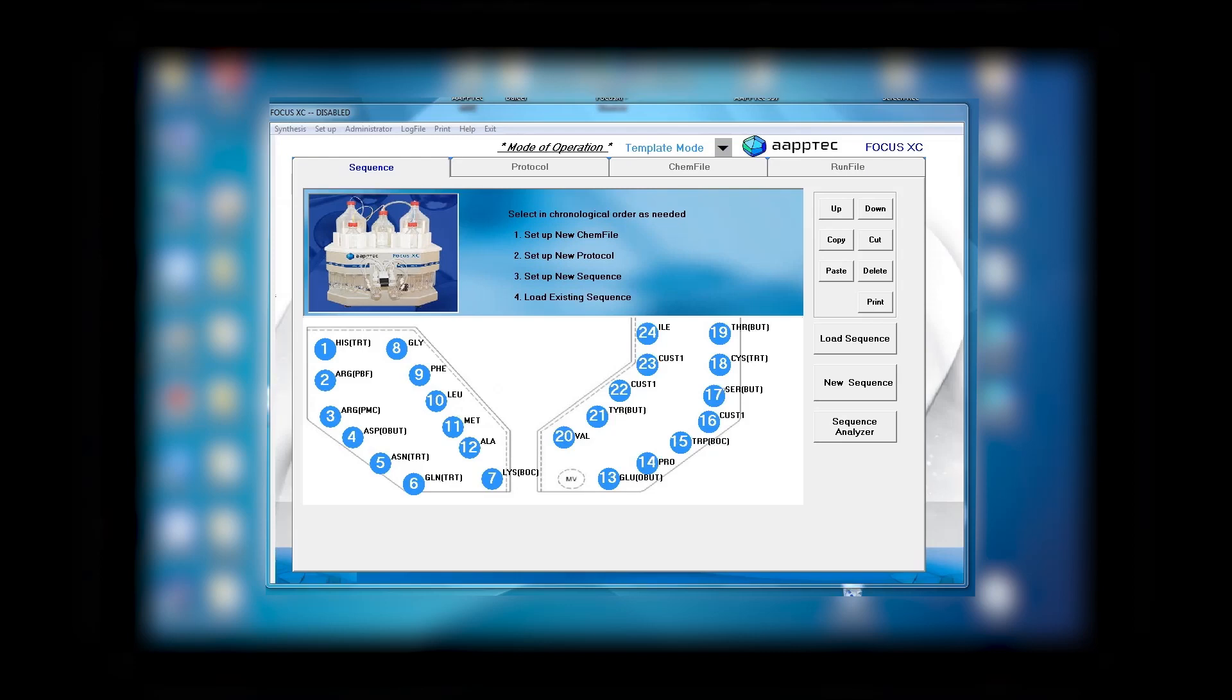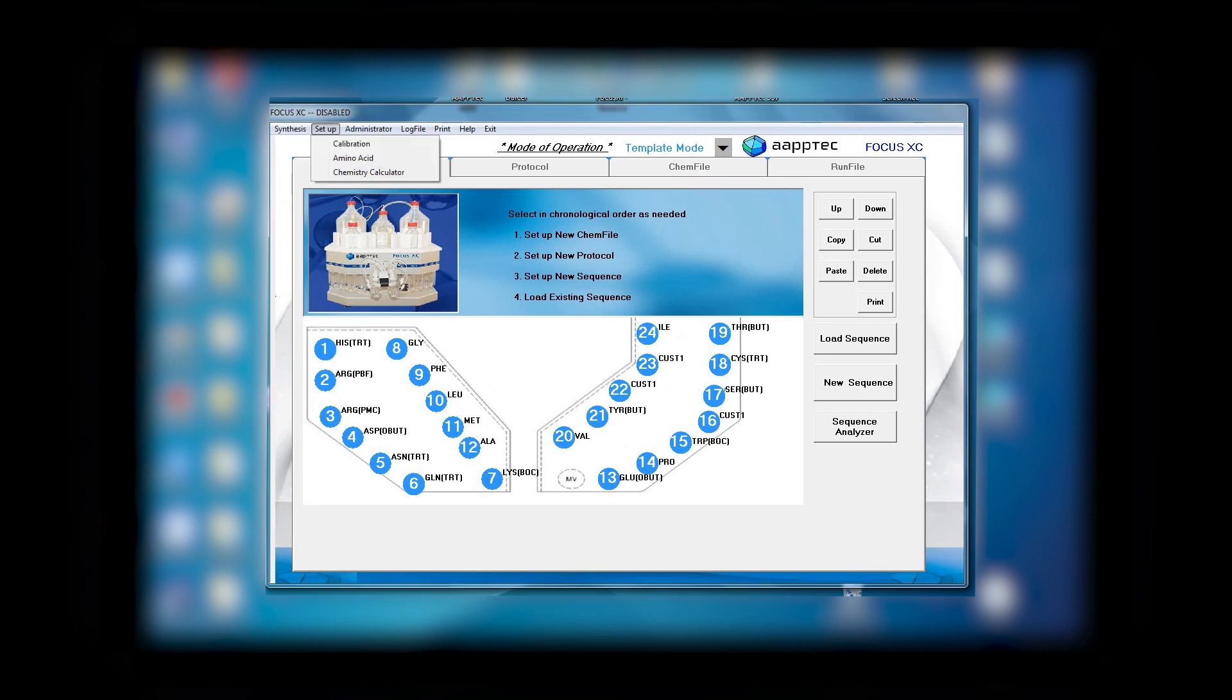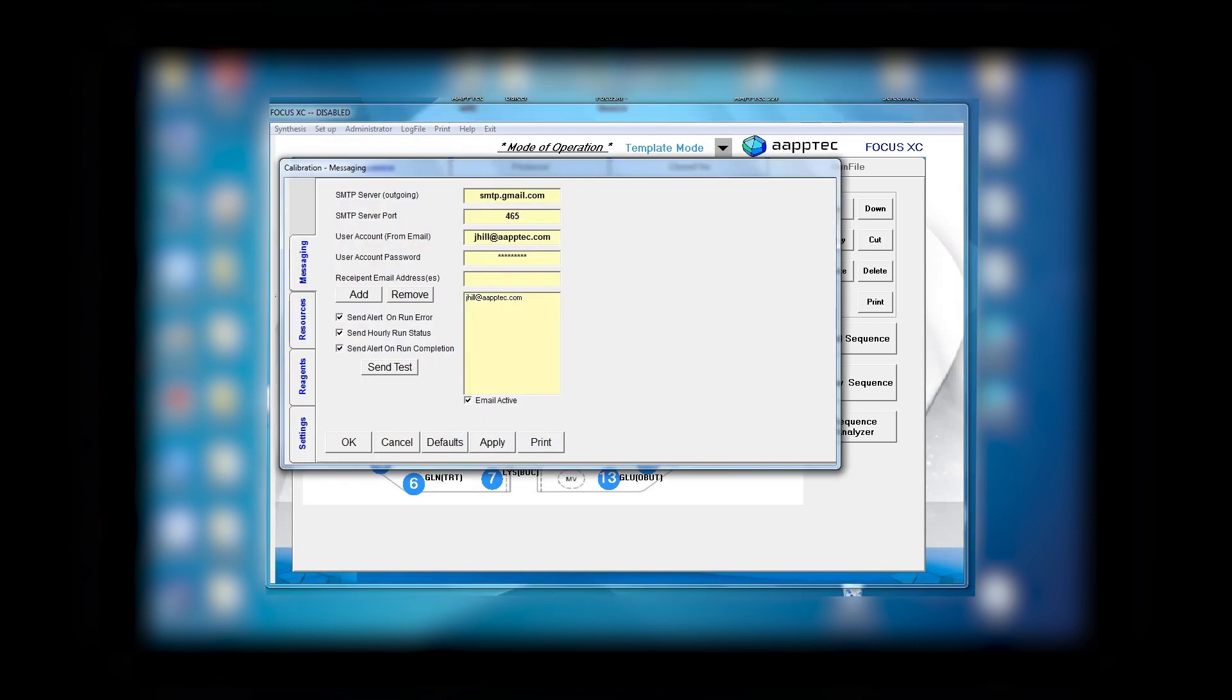The Focus XC comes with one, two, four, or six reactors. It's great for a novice and excellent for an expert. We have two modes in the software: one can go to setup and calibration, then go to settings where we have a template mode and a protocol mode, and also a chem file.